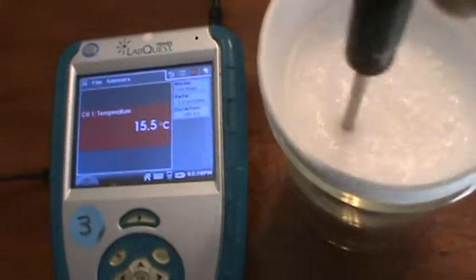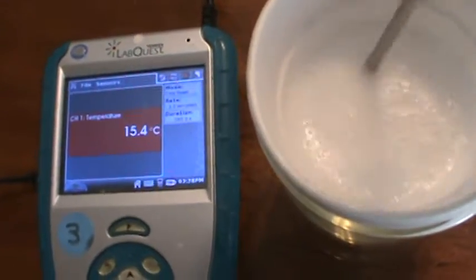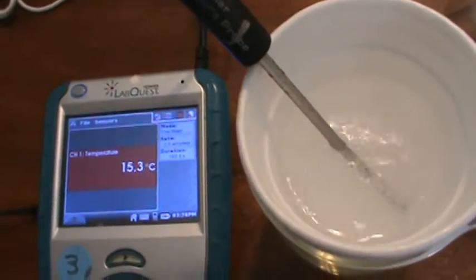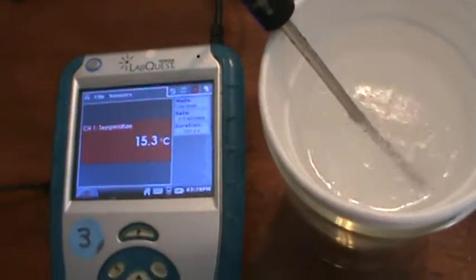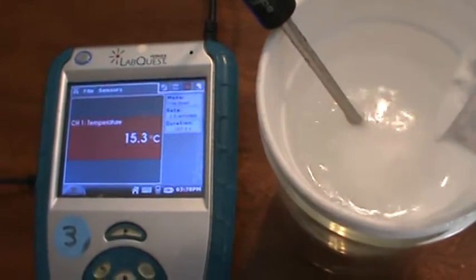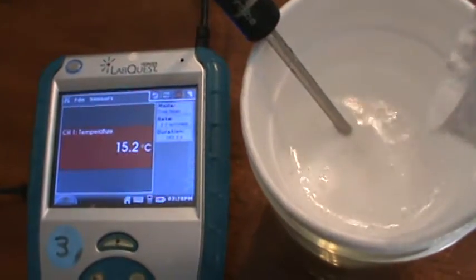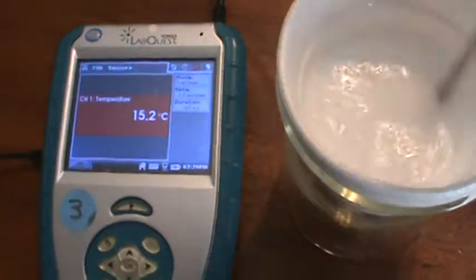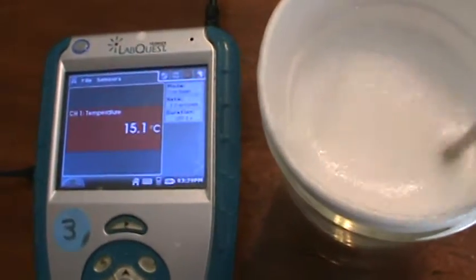And you'll notice that one of these boxes says heat of system equals Q reaction. Heat of system is Q reaction, equal to the opposite, or the negative, of Q water. And that's where you'll change it so that your sign reflects your system.